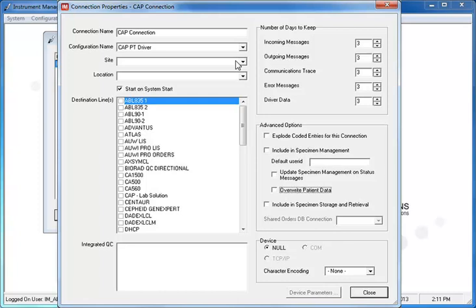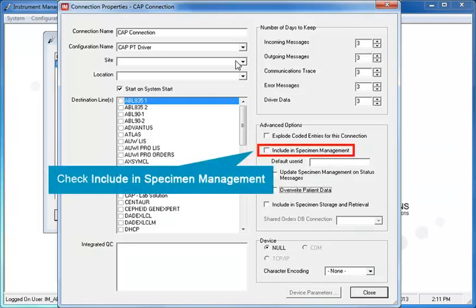The only other setting you must change is to check the checkbox for Include in Specimen Management, under Advanced Options.